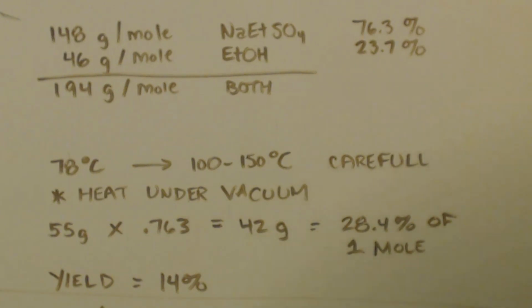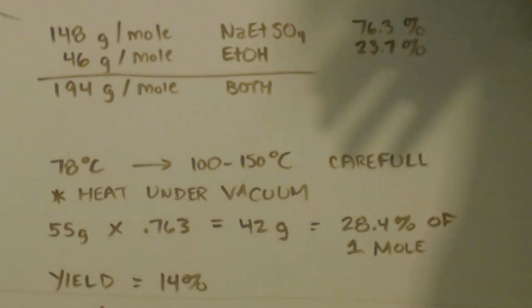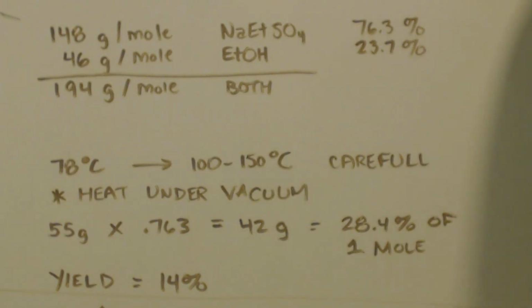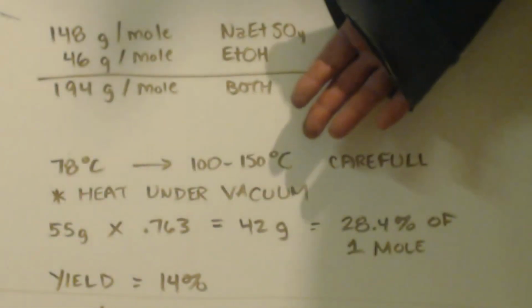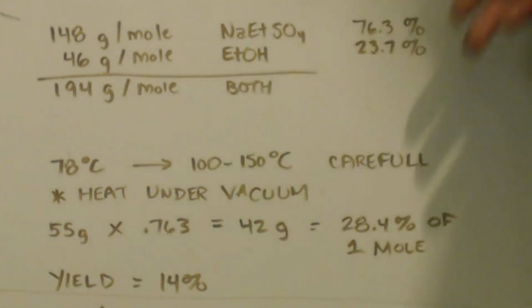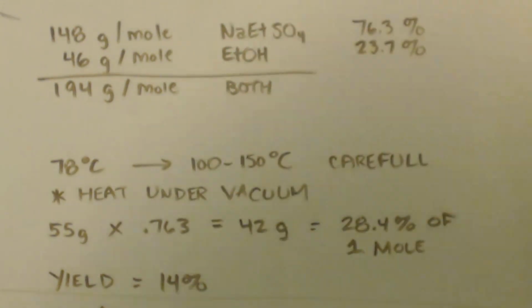How do you get rid of water crystallization when you want a salt to be anhydrous? Usually you just put it in the oven above the boiling point of water. You know what I mean? You put it in the oven at 300 F, 400 F, depending on what the salt is. But this is ethanol. Keep in mind, you would be putting ethanol fumes in your oven that are very flammable if you did this. But you might be able to just put it in your oven at 100, 150 C. And like I said, you might be releasing this ethanol into your oven and then it catches on fire.